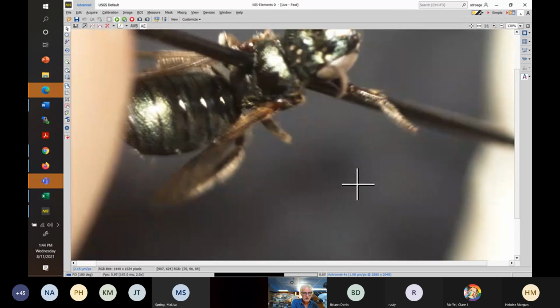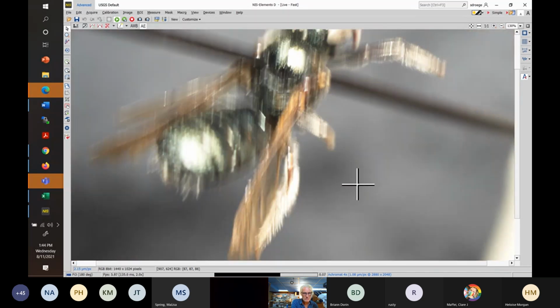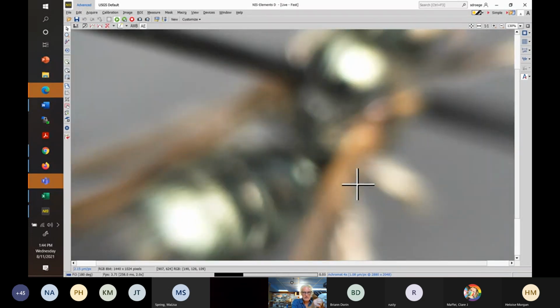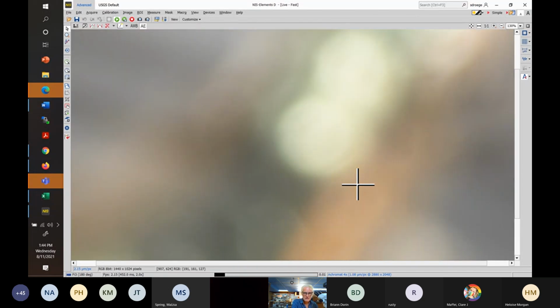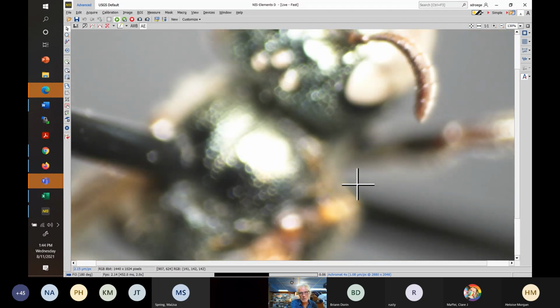But when we go to the scutum and look at the amount of pitting in the marker region between the parapsidal lines, you'll see a very blurry image right now, but it will emerge that there is a heck of a lot more.